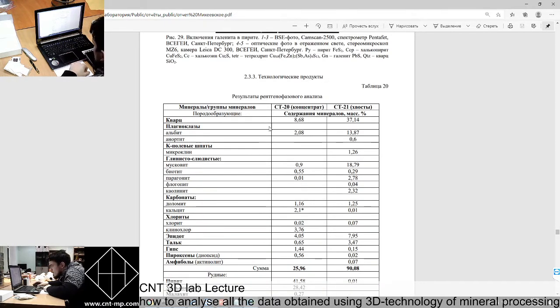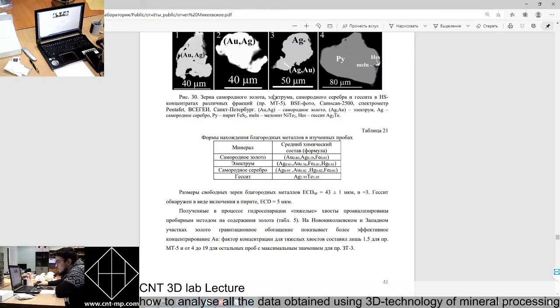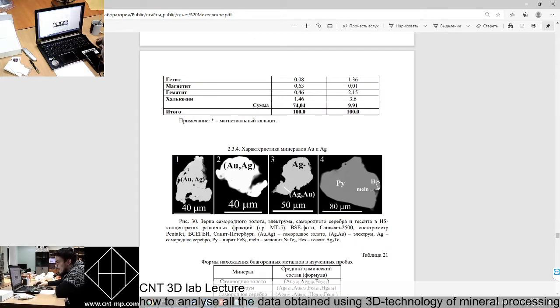And in the end is the results of analyzing the process product, flotation concentrate. Actually, we found 4 gold grains, but the client told us to cut off that information because in Russia there are troubles with exploration of deposits, because if you have gold in your deposits you have to prove how much of that gold you have in your deposits.